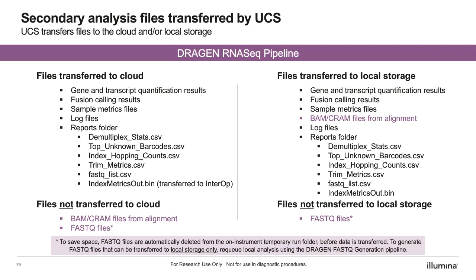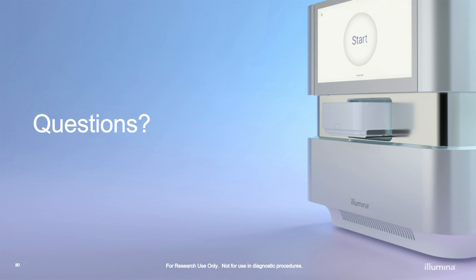Okay, so that brings us to the end of this presentation. I want to make sure that we get to some of the questions.